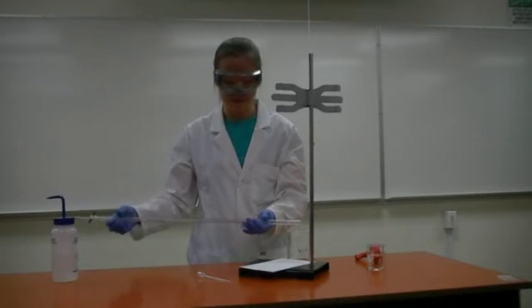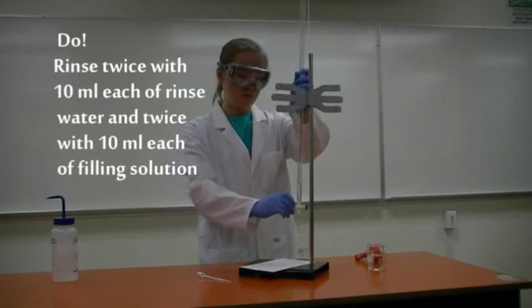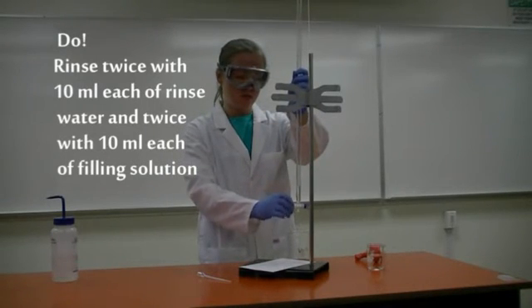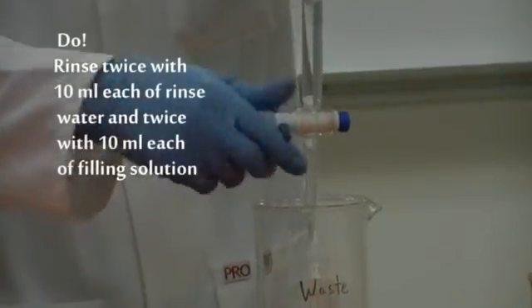By doing this, you ensure that the concentration in the burette is accurately known. Rinse twice with 10ml each of rinse solution and filling solution.